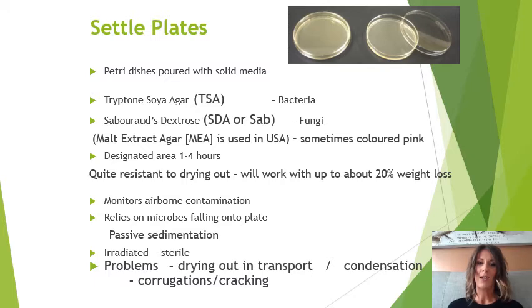So as you can see here, if you work with 4 hours, you're increasing the likelihood, especially in equipment which is designed to extract air from it, for example, isolators, or push air over the top of the surface, the risk of the medium drying out is significantly increased. Therefore, the maximum time we can expose our plates is 4 hours to reduce that desiccation, because if you desiccate the nutrient agar, it inhibits the growth of bacteria. So conversely, 30 minutes probably wasn't long enough. 4 hours, you wouldn't want to go above that because you could inhibit the media in terms of recovery of bacteria because they need that moisture.